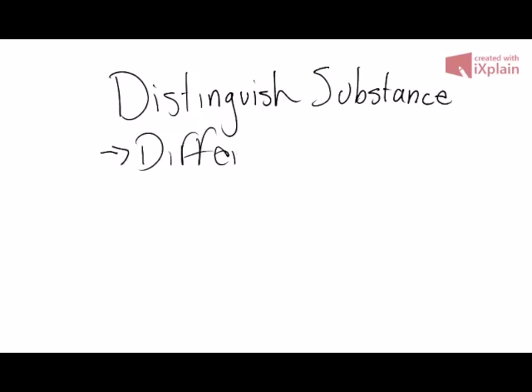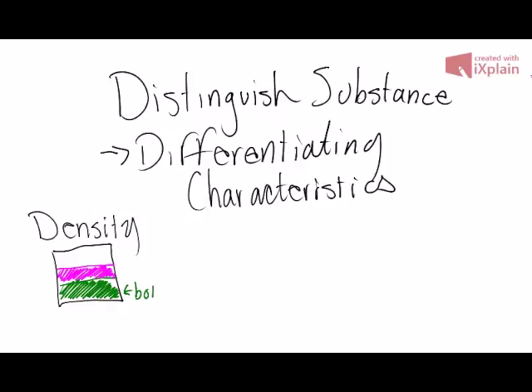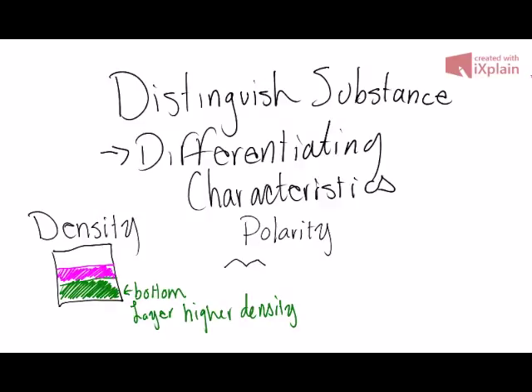Throughout the experimental synthesis of benzyl acetate, the differentiating characteristics that were used were the density, which allowed substances that had a higher density to move to the bottom of the beakers, which allowed for the separation of the substances, the polarity, which allowed for certain substances to mix and other substances to remain separated, and the color after separation, which allowed us to differentiate between the different layers.